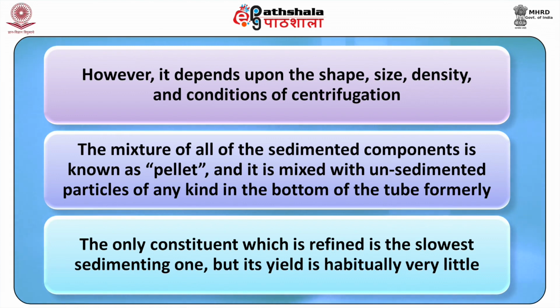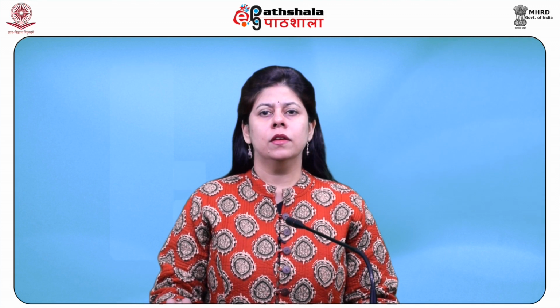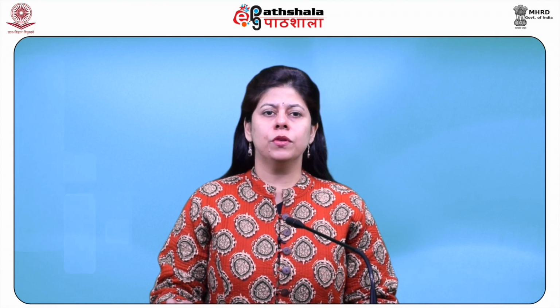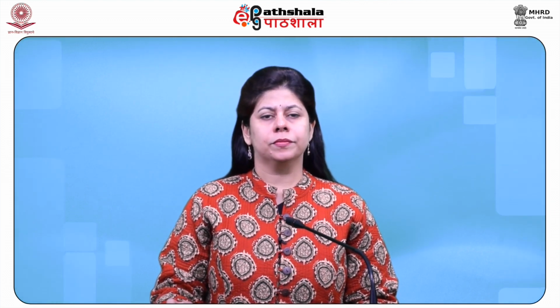The mixture of all of the sedimented components is known as pellet, and it is mixed with unsedimented particles of any kind in the bottom of the tube formerly. The only constituent which is refined is the slowest sedimenting one, but its yield is habitually very little. The two portions are recuperated by transferring the supernatant solution from the pellet. The supernatant can be recentrifuged at greater speed to obtain extra purification with the formation of new pellet and supernatant.